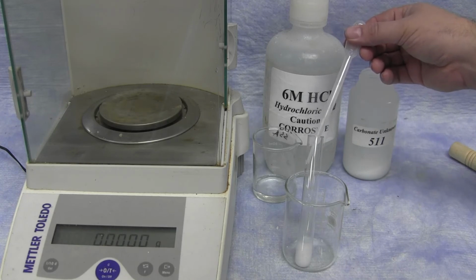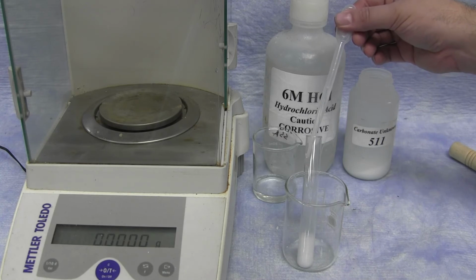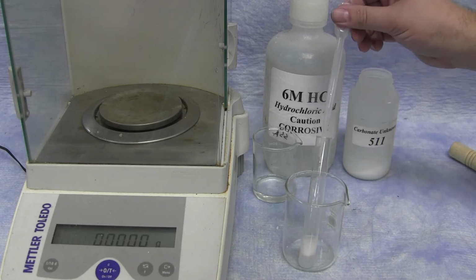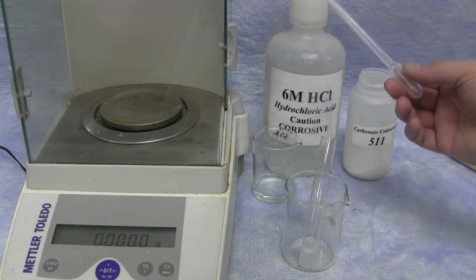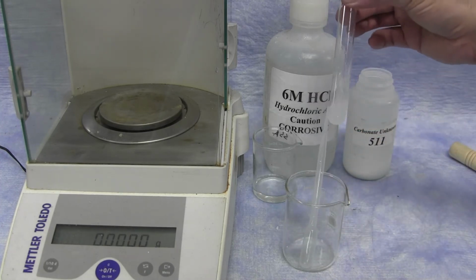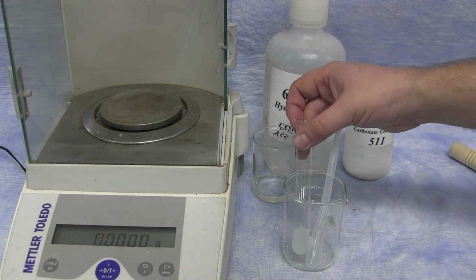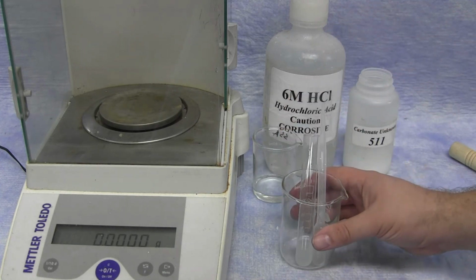It's going to undergo a reaction where the carbonate is producing carbon dioxide gas. The carbon dioxide gas bubbles and leaves the test tube. This will end up decreasing the mass of the overall amount.